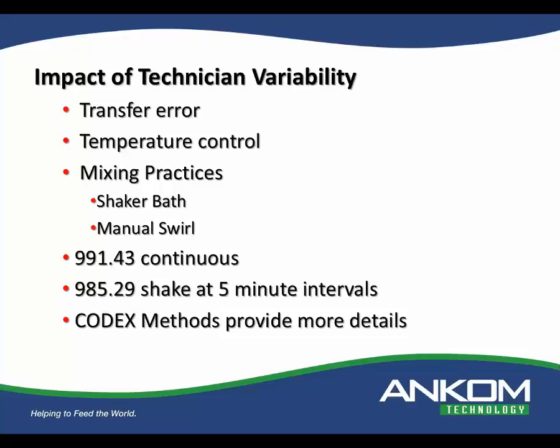There's a lot of issues when it comes to controlling temperature, controlling mixing, the transfer error, the filtration process, and things like that, which we'll be talking about. When we were designing the instrument, that was one of the biggest issues that we had to look at, and that's this idea of transfer.